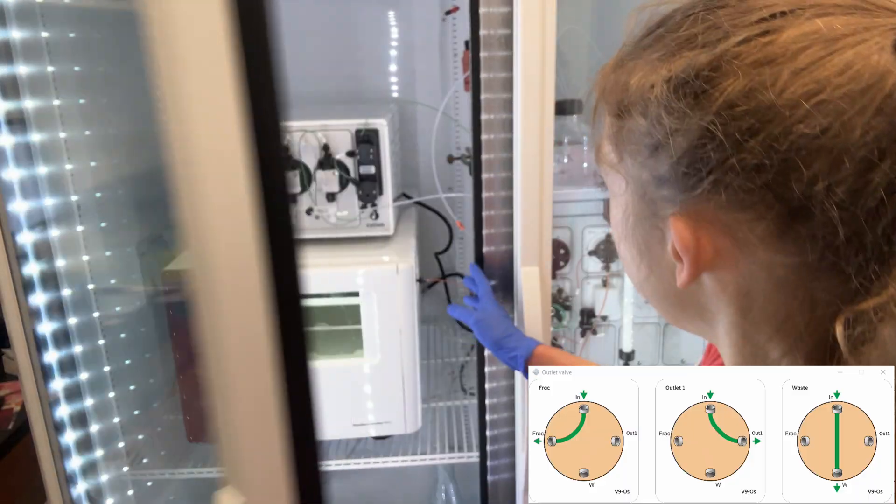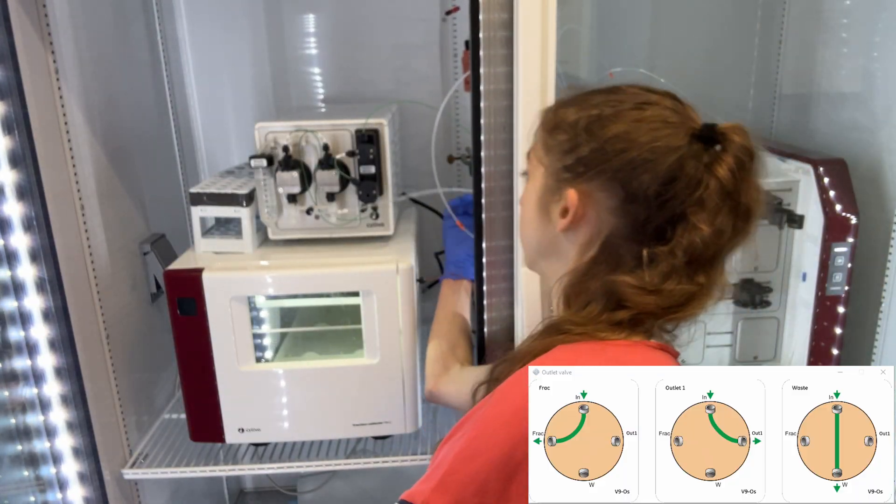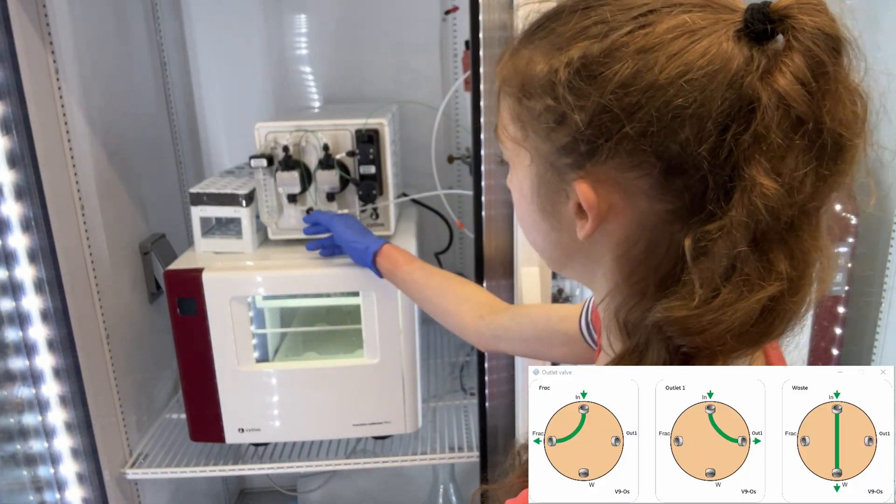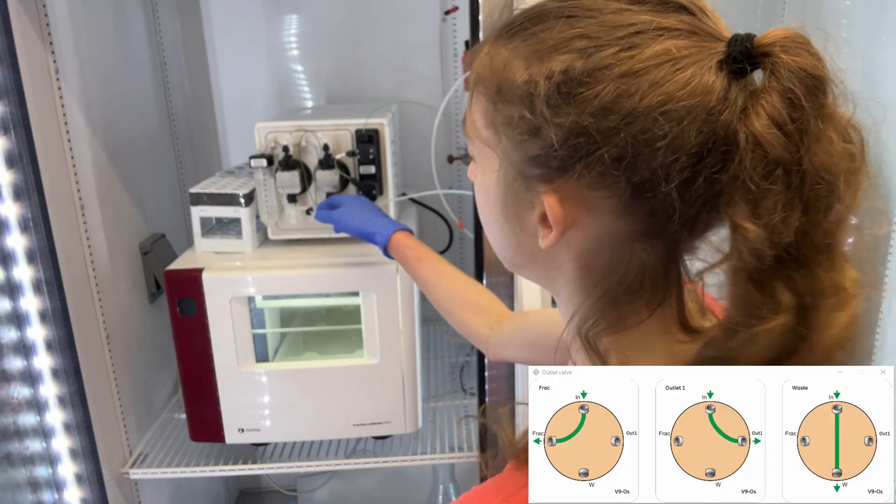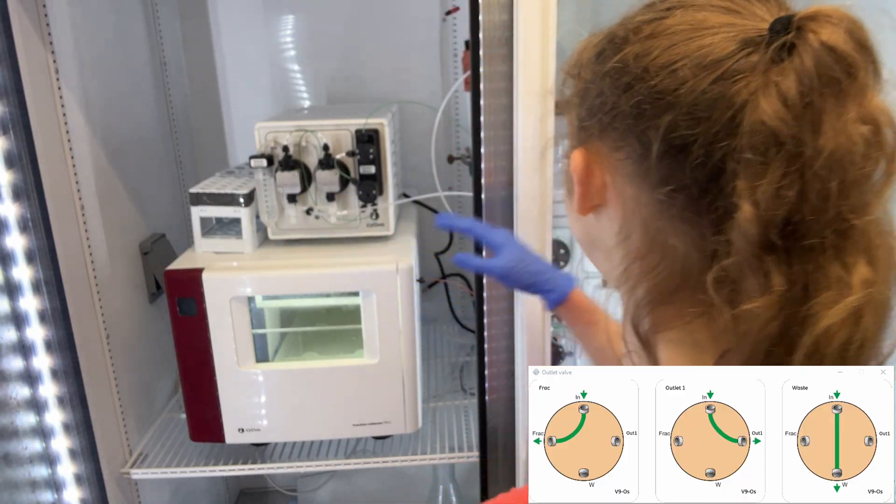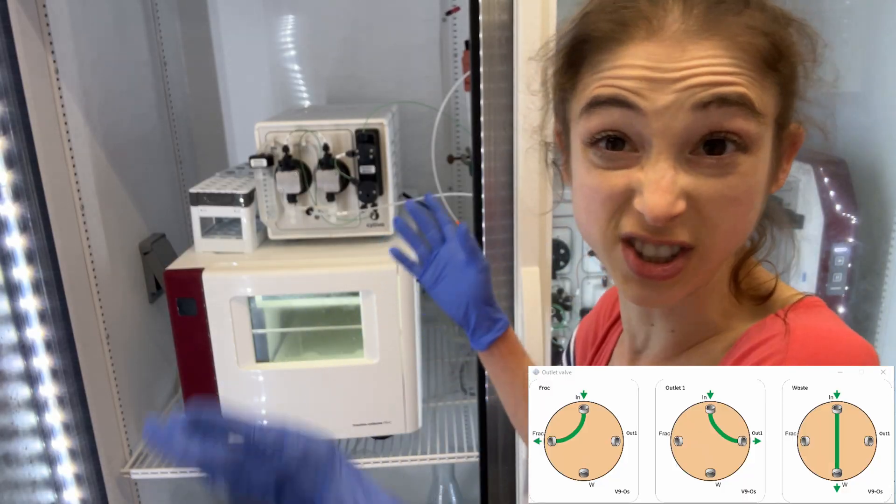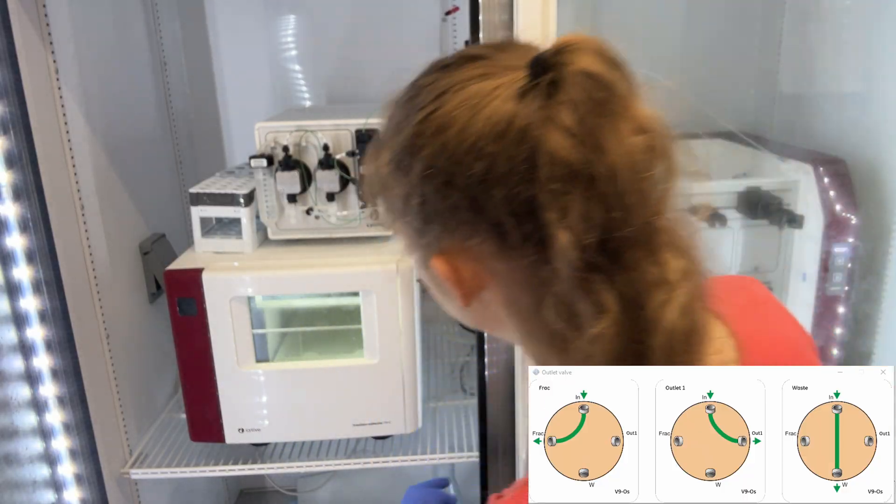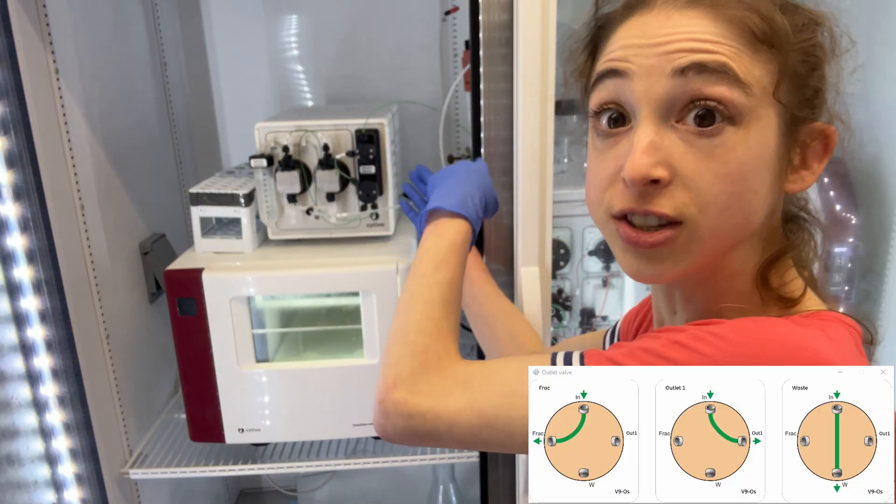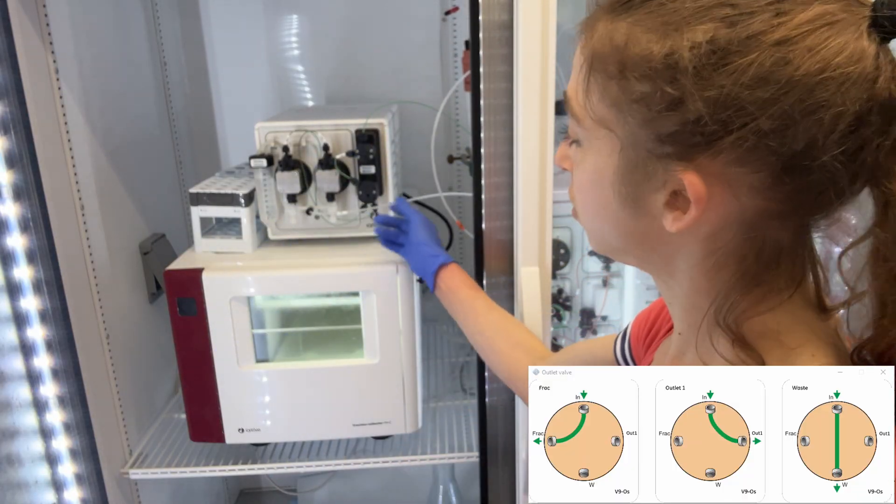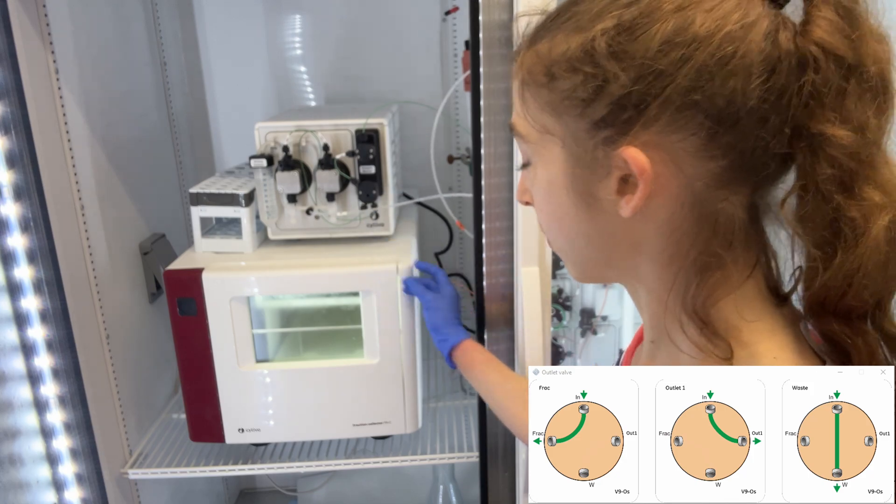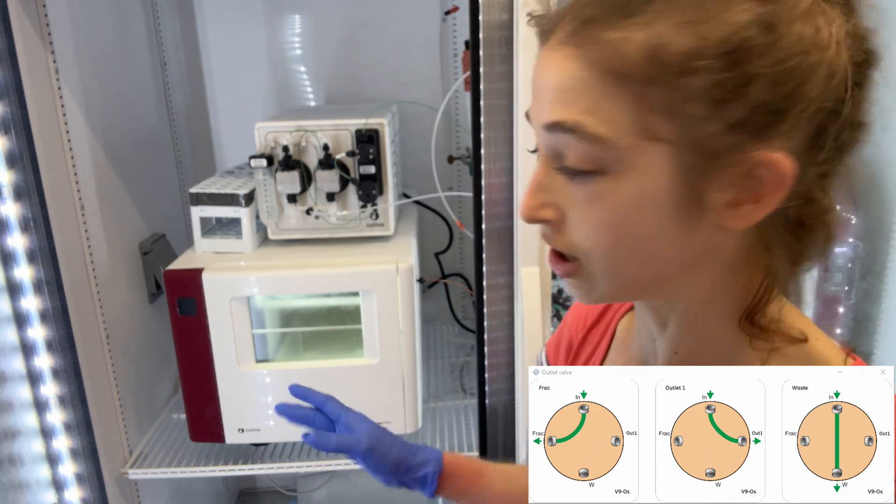So there is a line that goes into the fraction collector from the column, and this line needs to be washed after your run, not just washing when you go set to wash things normally. It just goes out through the waste, but you need to set it to directly go to the fraction collector to wash this tubing and wash all the tubing that's associated with the fraction collector.